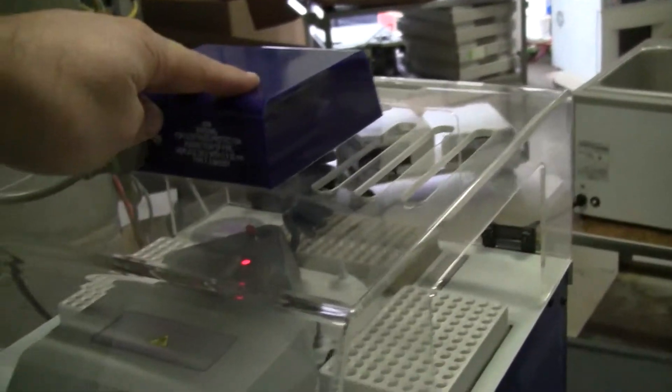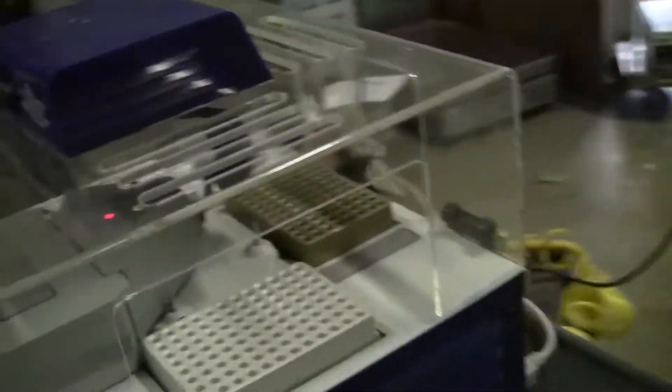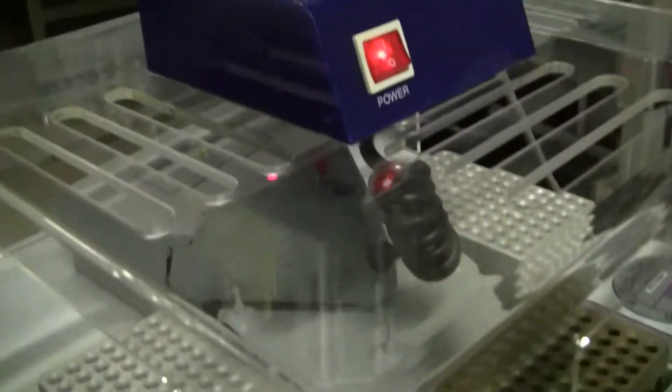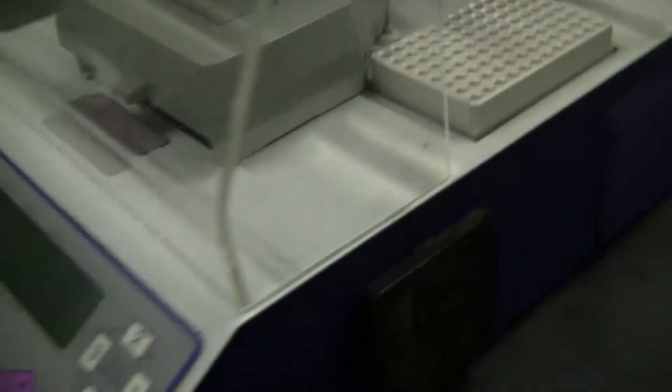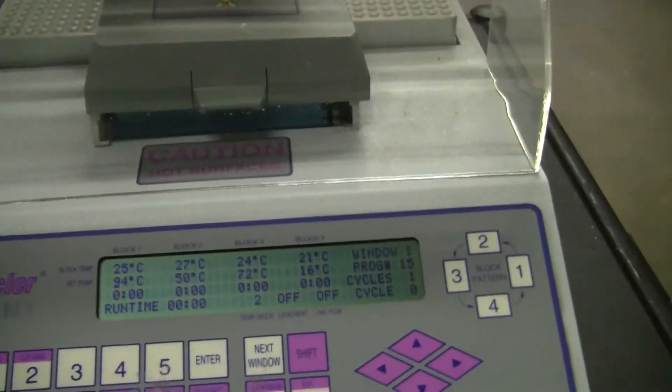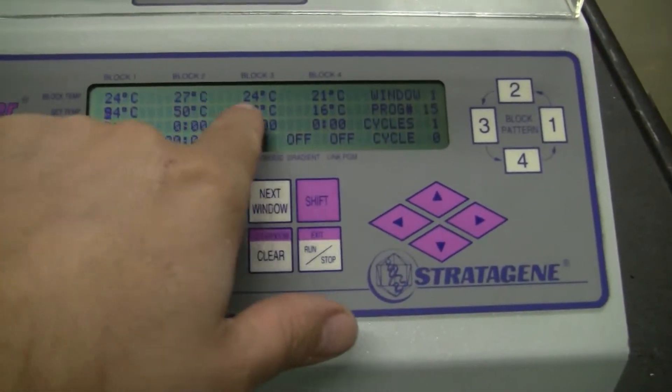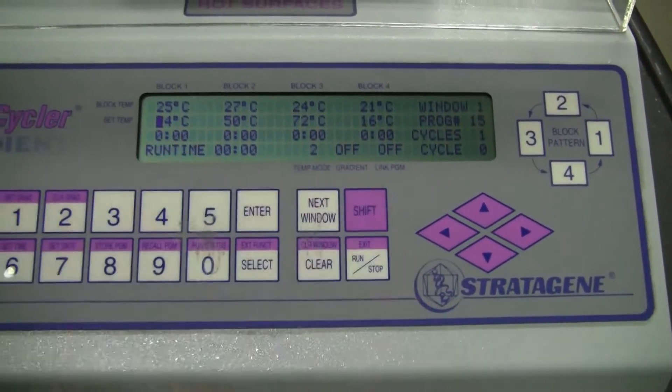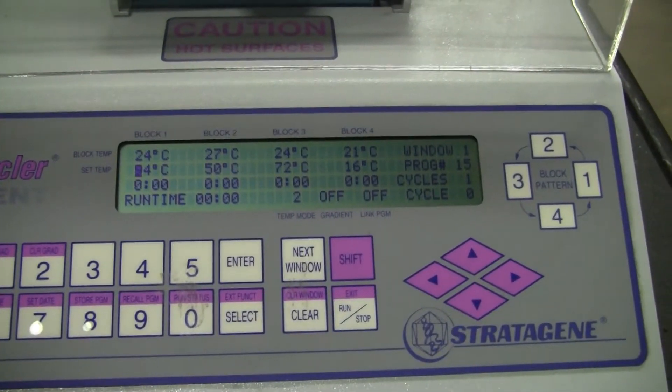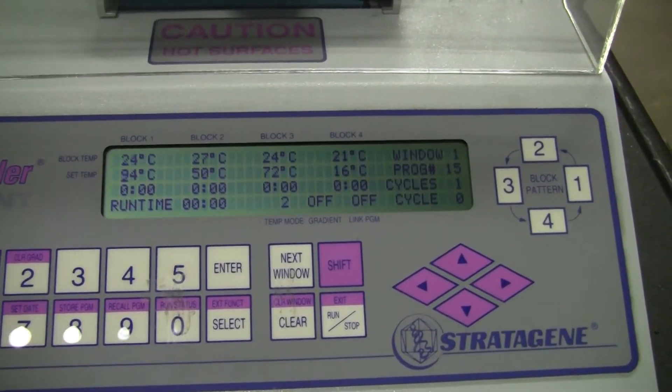It does come with the extra power that goes to the heater cell right there. What I'm looking for is an increase in temperature going up to these set points. This is the preheating cycle. Now you can see it's going up.